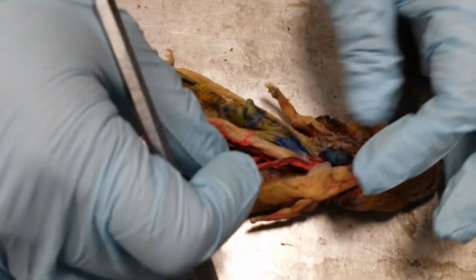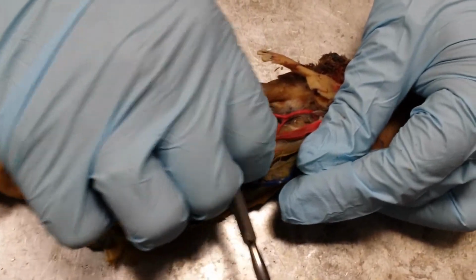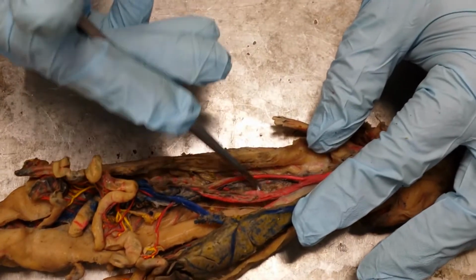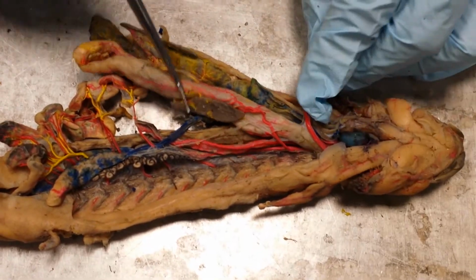Okay, so you'll see these little flimsy things in here. There's one on each side. These are the lungs. Those are the lungs? Yep. Wait, what? These things. It's a lung? There's one on this side. Really? What the heck? Okay. I missed that part, apparently.